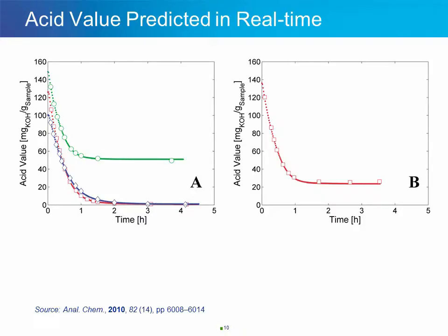Building on my last comment on the value of using multiple experiments to predict future reactions, this can be essential when reaction conditions change, such as when there is a variability in the raw materials, or in this case where they wanted a model that could accurately predict reactions with different molar ratios of substrates.